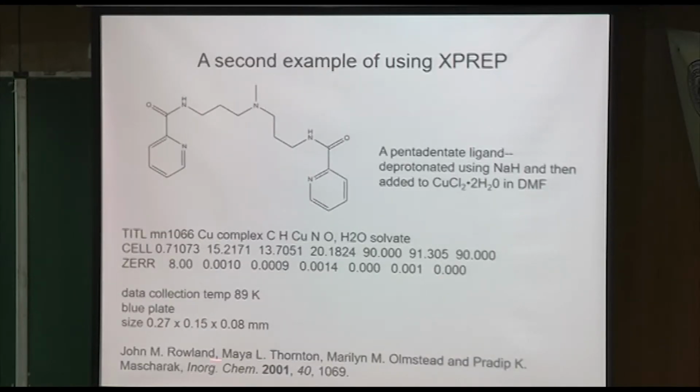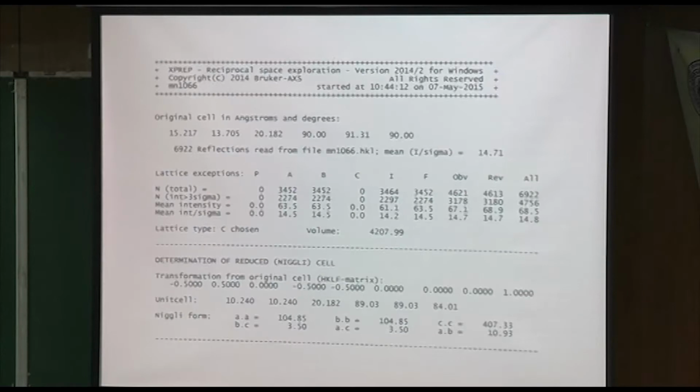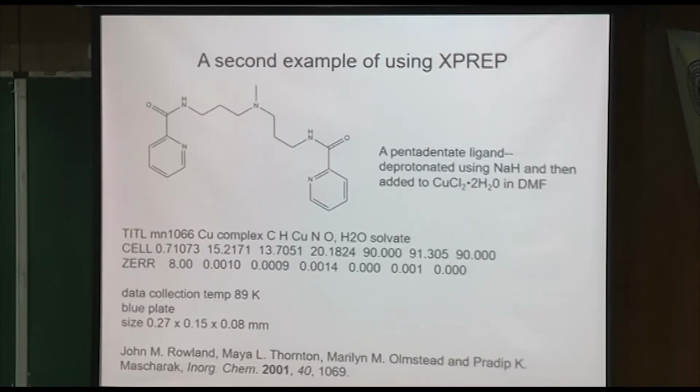So another example, using XPrep. You may recognize some of these people too. It was done for Pradeep Mashrak quite a while ago. But anyway, it's a pentadentate ligand, as you can see. And it was deprotonated using sodium hydride and then added to copper chloride. So it was expected to be a copper complex. There was water present because he started with the hydrate. It was in dimethylformamide. That didn't end up in the structure.